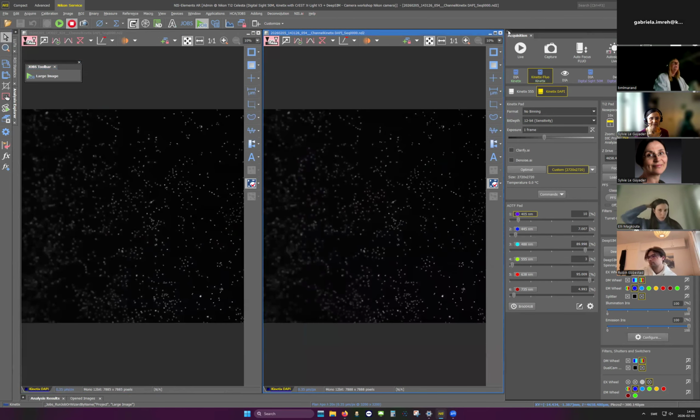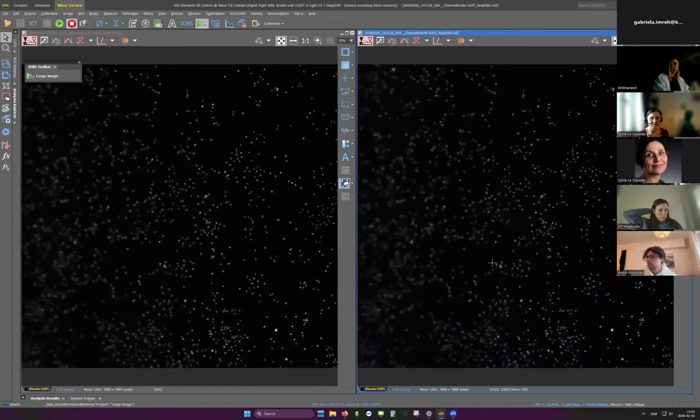And another thing, let's say that you don't need this large field of view, maybe, but you would like to capture a larger field with higher resolution, meaning that you can get the same field of view with a 40x objective as the 20x objective.